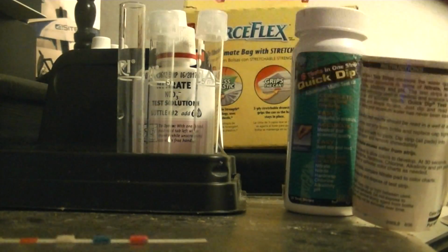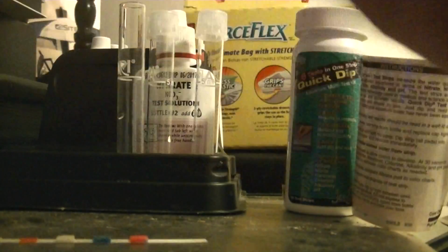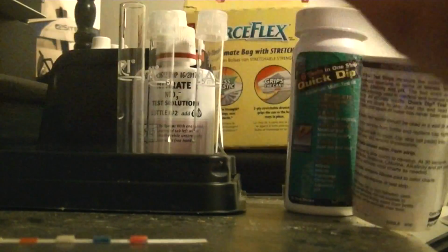Now I've done this test about 10 times. I've tested water I bought from the store, I've tested my tap water, I've tested my tank waters in all my tanks, and I found that you should shake this like it says for about a minute, and then it tells you to wait for 5 minutes, but after I shake this for a minute, I really don't have to wait 5 minutes. After I wait like 10-20 seconds, it's pretty much the same color it's going to be after 5 minutes. I've let it sit for 5 minutes and compared my findings, and pretty much it's a finished product after you shake it for close to a minute.